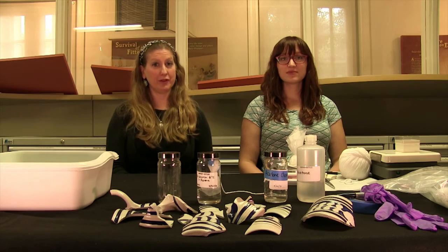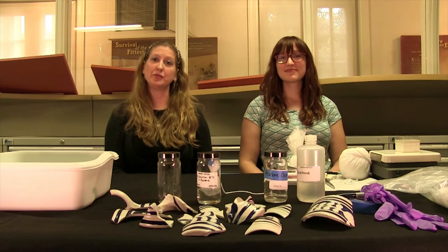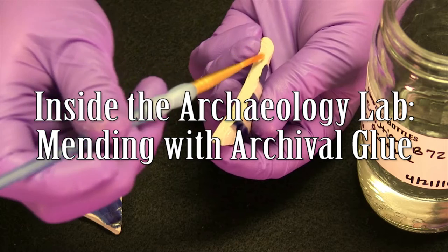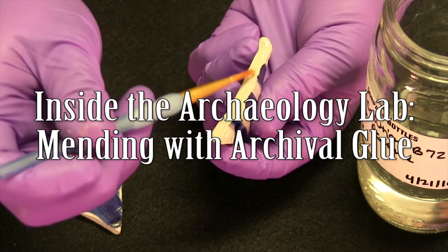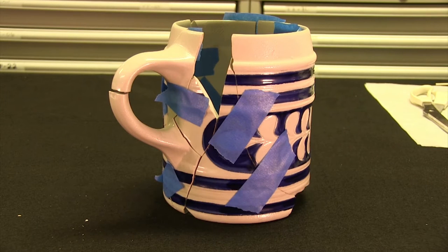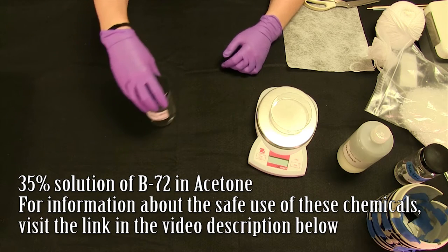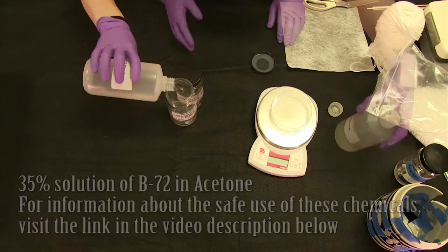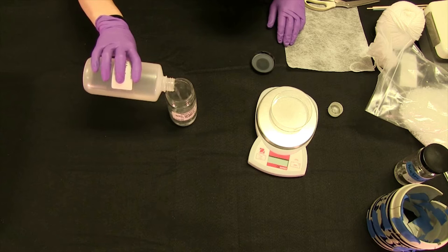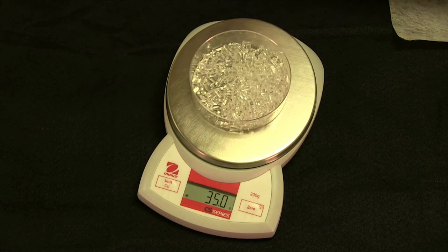Today we're in the archaeology lab at Ferry Farm again. I'm here with Lauren Jones and we are going to talk about mending using archival glue. We're going to make archival glue to put back together our tankard. I'm going to make a 35% solution of B72 in acetone, which means I will be measuring out 65 milliliters of acetone and 35 grams of B72.